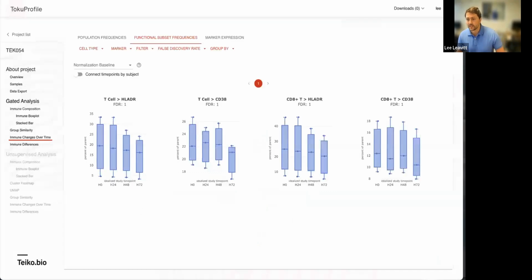So first, what I want to show is what this is all about. We want to visualize the data normalized to any time point. In this data set, we are testing the stability of PBMC samples that have been fixed and then stored in a 4-degree refrigerator for 0, 24, 48, and 72 hours. That is in comparison to samples that are stored at a negative 80-degree environment.